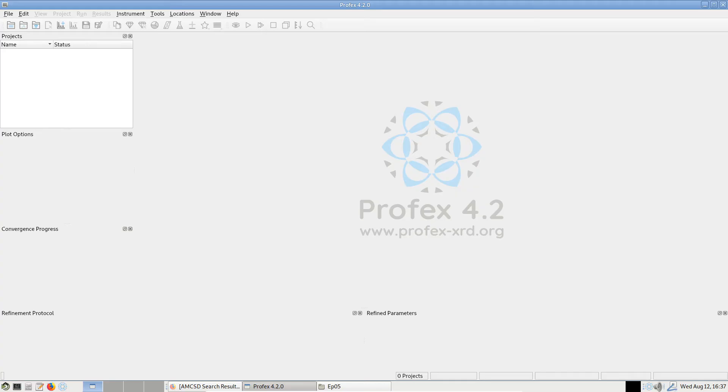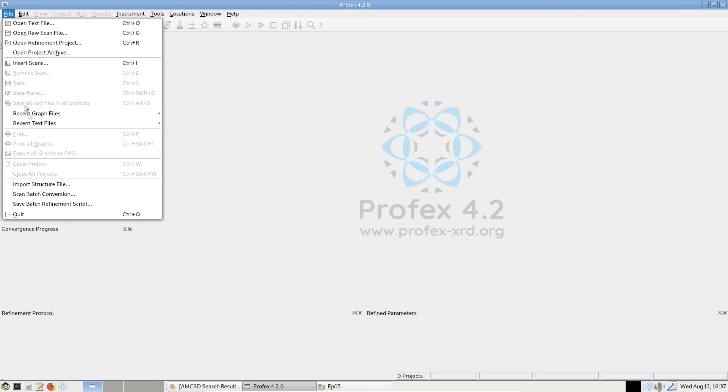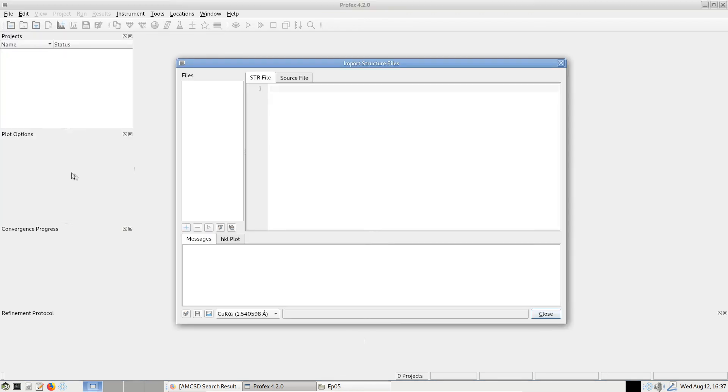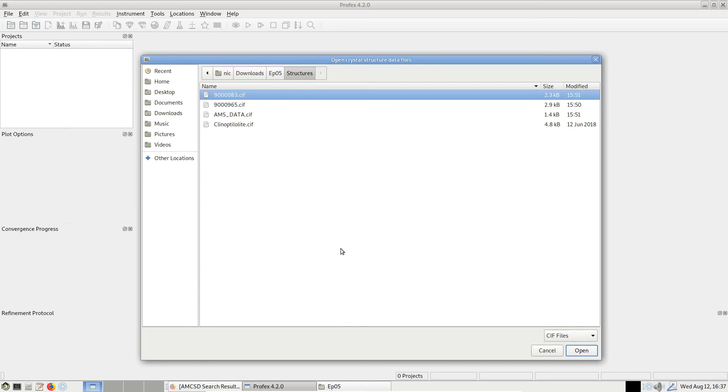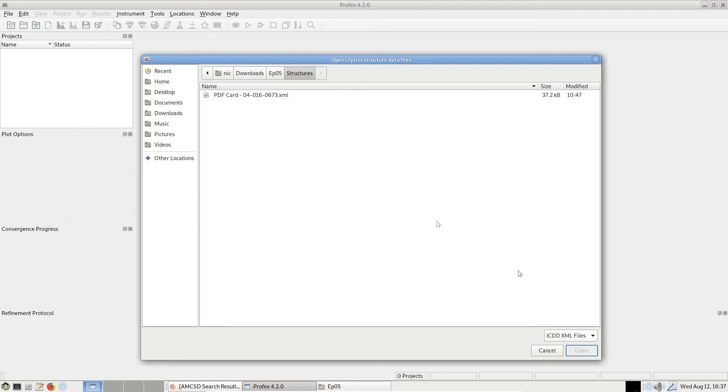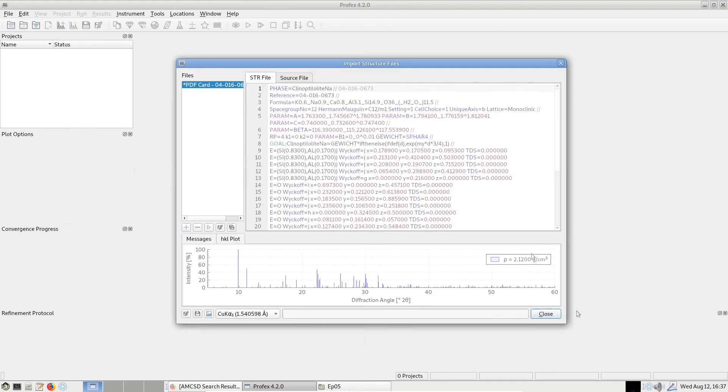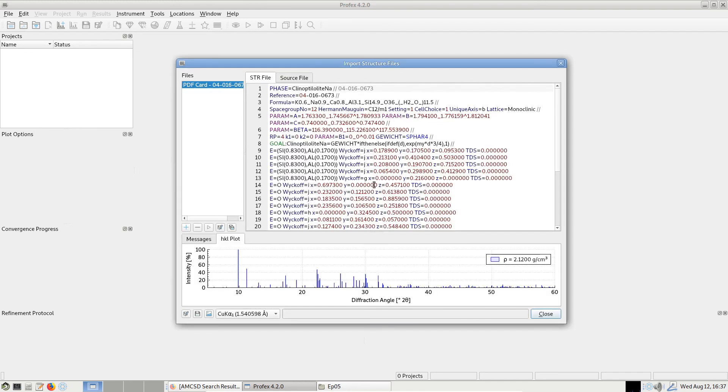Importing XML structure files from the PDF4 database works exactly the same as with CIF files. We go to File > Import Structure File, then we click the plus button. And this time we have to change the format from CIF to ICDD XML files. Now we see the one we just exported from the database. We click Open.